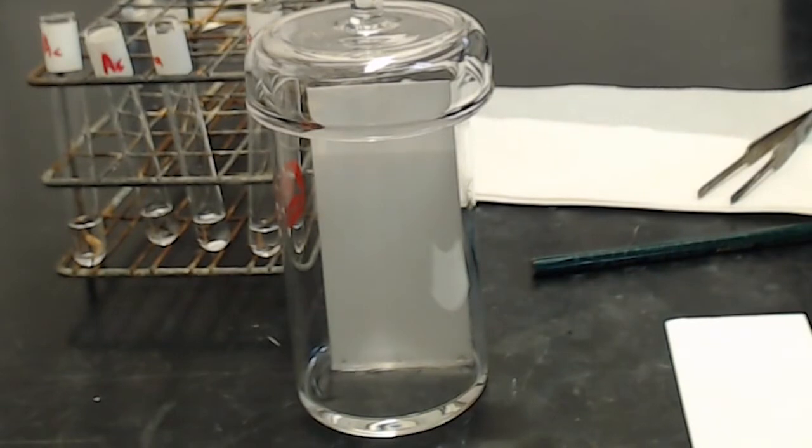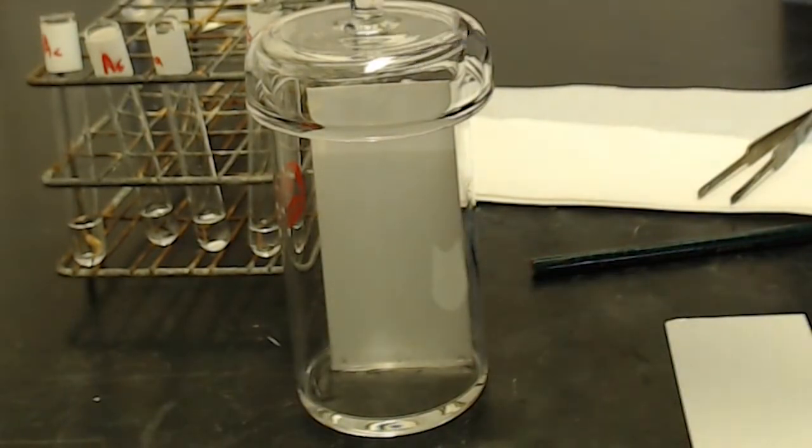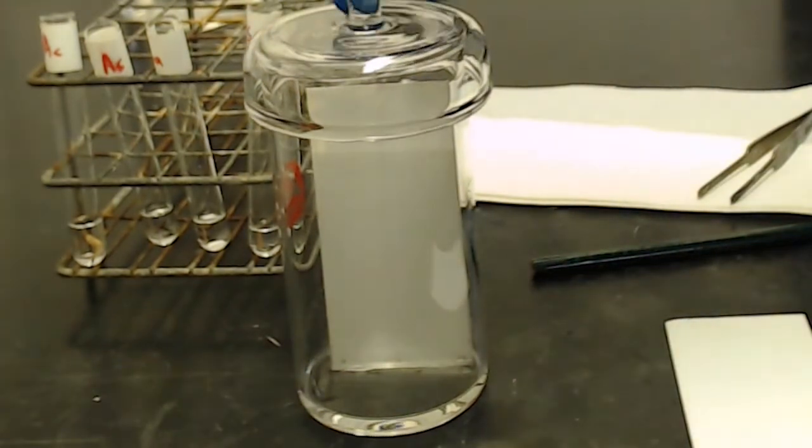All right, we're going to call this one good enough. The main thing here is that when you pull your plate off, the first thing you do is mark where that solvent line went. If I just let it evaporate and dry on its own, I won't be able to tell where it went.